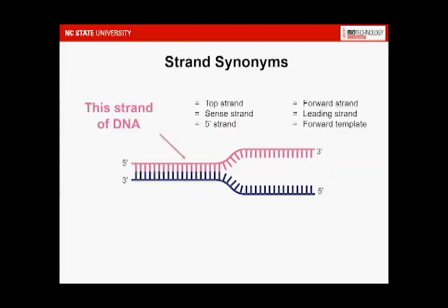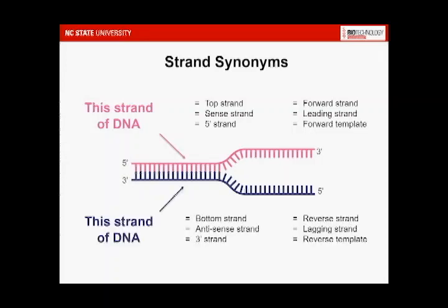This top strand of DNA is also called the sense strand, the 5' strand, the forward strand, the leading strand, or the forward template. Conversely, the bottom strand is also called the antisense strand, the 3' strand, the reverse strand, the lagging strand, or the reverse template.